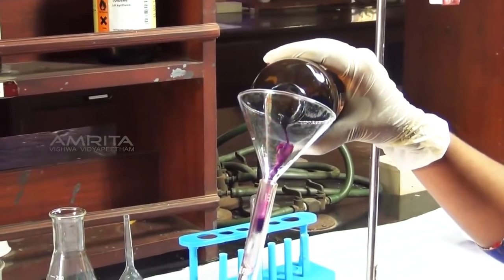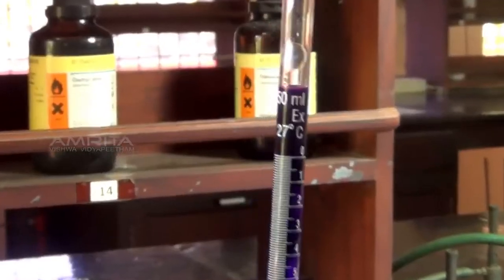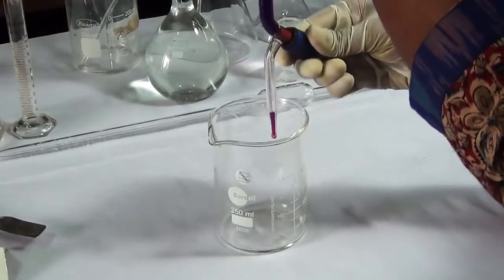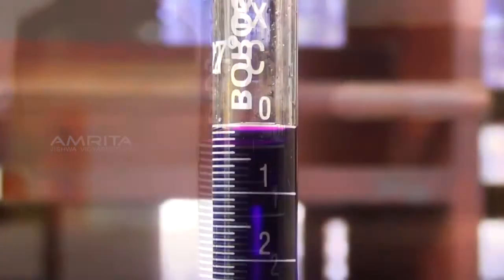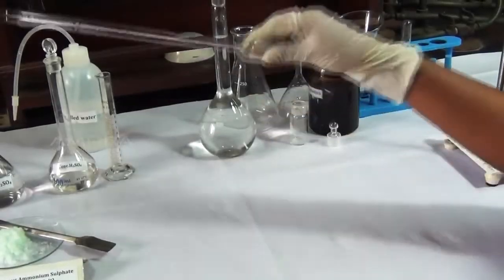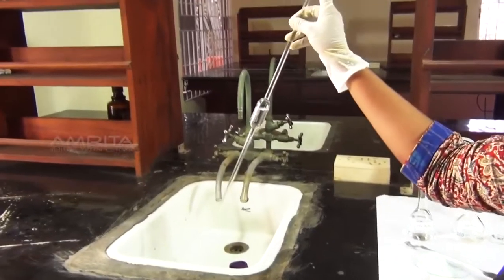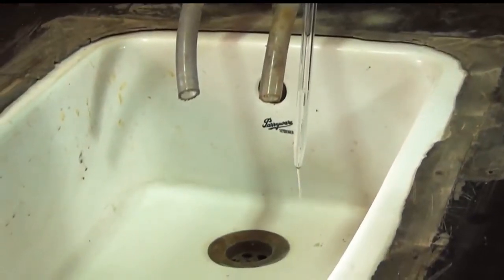Use the funnel to fill the burette with potassium permanganate solution to just above the 0 mark. Place a beaker below the burette and slowly open the stop cock so that the potassium permanganate flows into the beaker. Then set the initial burette reading as 0. Take the 20 ml pipette, pipette out a small volume of distilled water. Rinse it and drain the water. Repeat this process 2 or 3 times to remove the impurities from the pipette.